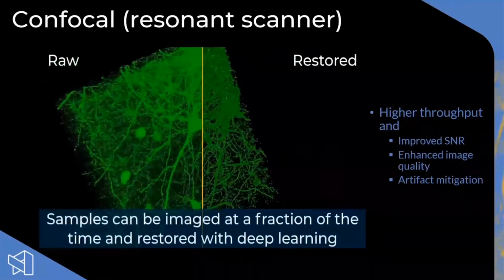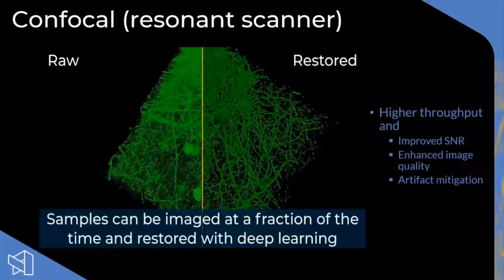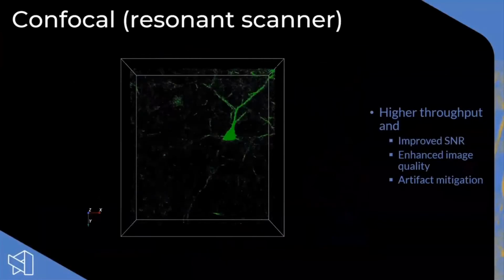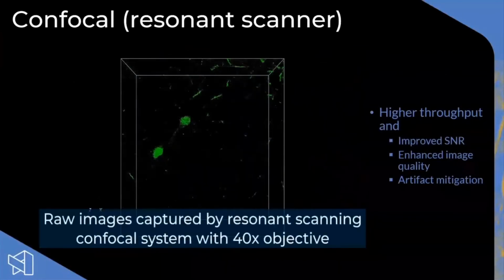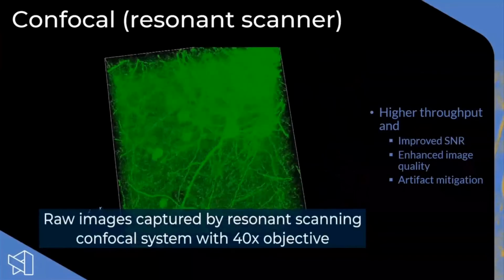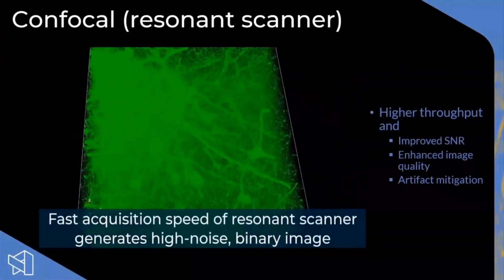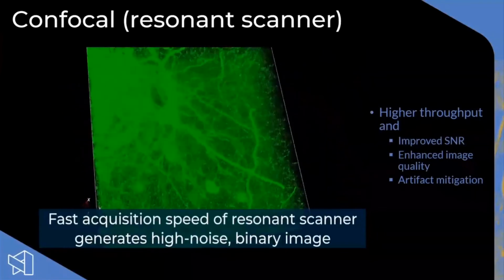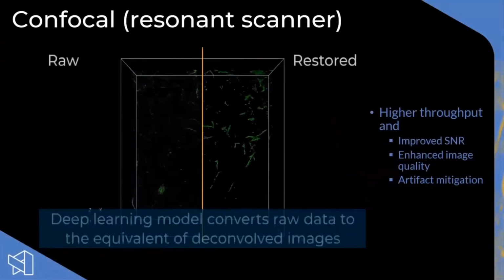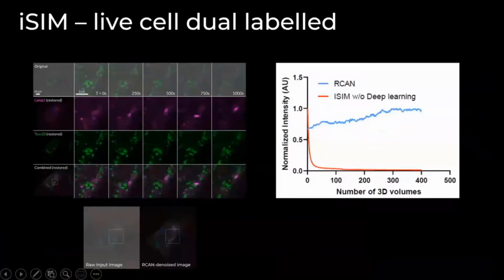And speeding things up a lot meant he wanted to image with a single line scan on the resonance scanner, go as fast as possible, and still get good enough quality to do quantitation on it. And that's what we achieved with this result. In this particular experiment, that was the objective, to get enough improvement to do image analysis on it. But in other cases, it's more about the sample sensitivity. And that's the next example.